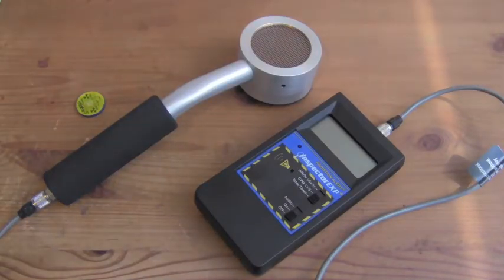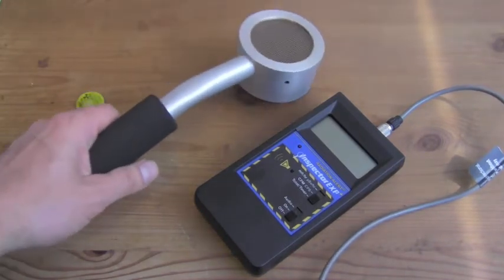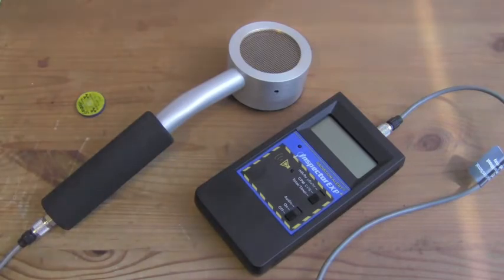This is the demonstration of the Inspector Survey Meter EXP with External Pancake GM Probe. This performs general purpose survey for alpha, beta, gamma, and x-ray radiation.